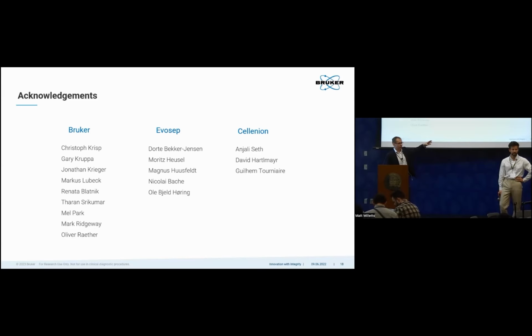So you need a very, very fast mass analyzer to be able to keep up with the speed. TOF gives you the ability to do 10 kilohertz, so very fast acquisition without losing resolution. On an Orbitrap, obviously you're going to get very high resolution, but as soon as you start to operate it in a fast manner, you lose out, coming to resolutions of 10,000 or below. So this approach of doing TIMS really requires a very fast mass analyzer at the back end for the whole process to work.